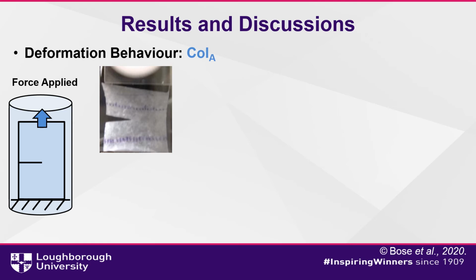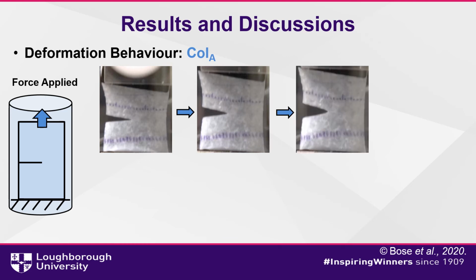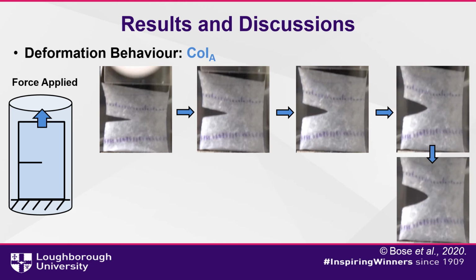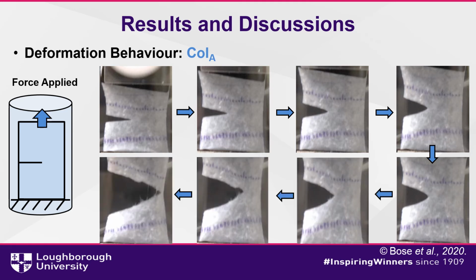As the tensile deformation begins, initially crack opening takes place at a very slow rate. This is then accompanied by crack blunting with a rapid crack propagation until failure. Hence, in aqua conditions, there is a gradual crack opening and propagation with an intensive plastic deformation as compared to in-air specimens.